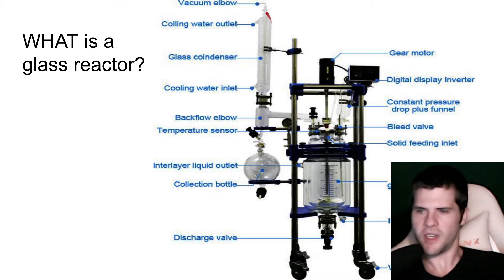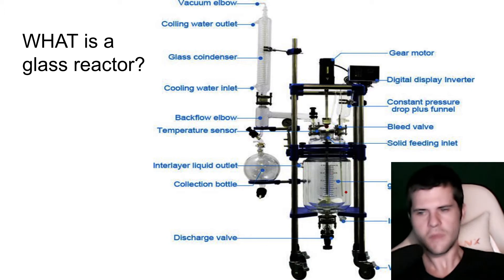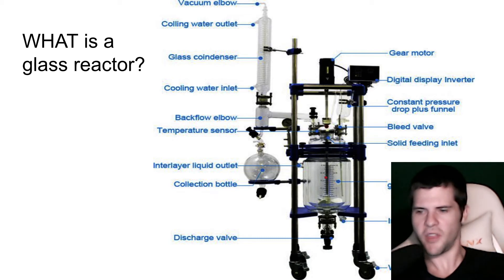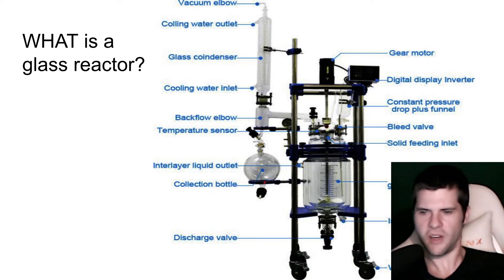This is our condenser right here — a glass condenser. This will actually have a cooling water or chilling fluid outlet and inlet. If you're ever filling up chilling fluid, you want to fill against gravity so that it fills every part of the material. Basically, as you reflux or boil off anything that comes into a vapor under boiling point, it'll transfer up through the vacuum, travel along this condensing coil, turn back into a liquid, and fall into our collection bottle. At the bottom of the collection bottle, you'll see a discharge valve where you can pull it back out.